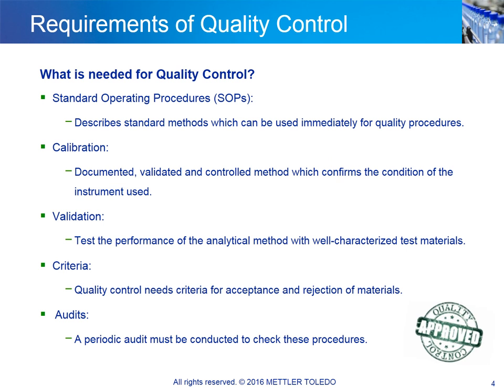A basic quality control system should routinely check required specifications and use these data to create a record of the production process. The first requirement for such a system is to have a standard operating procedure, or SOP, which describes exactly how to operate any instruments used and how to prepare samples. Regular calibration and instrument maintenance is recommended, and this history should be recorded.